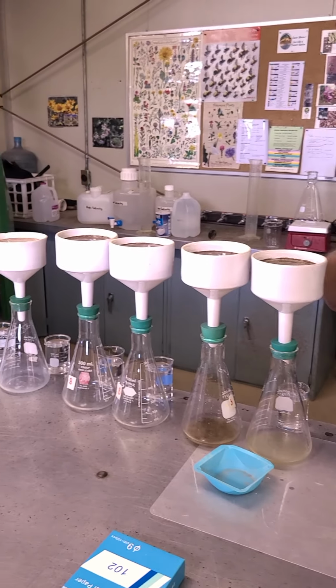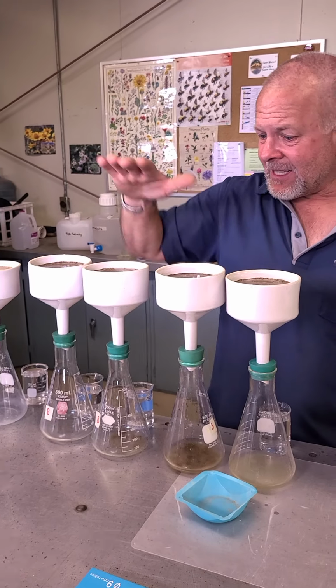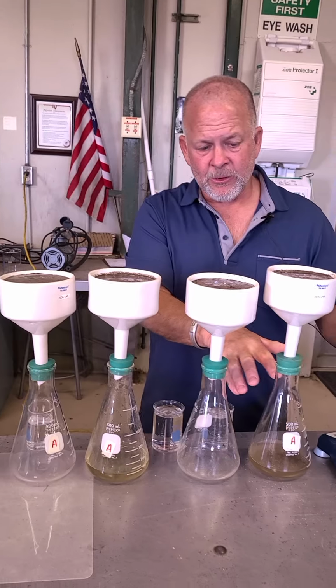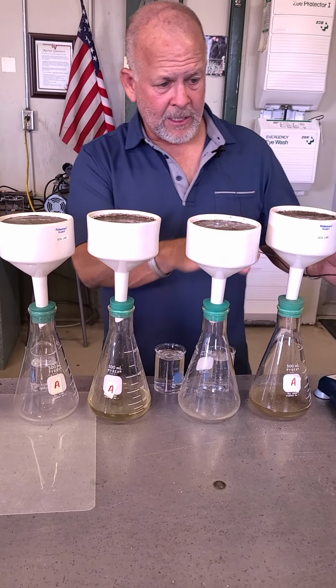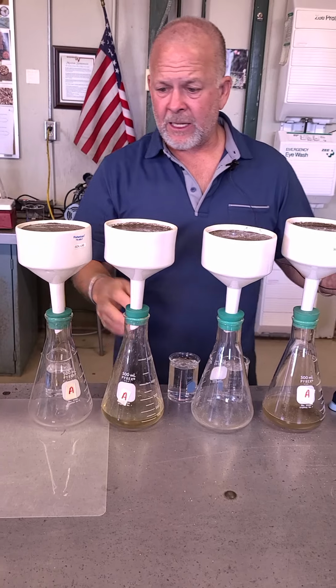So I've got the loam right here, and I've got the loamy sand here in the middle, and the silty clay loam here at the last four. So there's the same amount of water pushing down across the sample. So that's that same head. But now you can already see some interesting things going on through here. There's some dirt in this first one. It looks like there's a lot more water in number 1 and in number 3 on this. I don't even know if number 4 has even dripped through on this one at this point.